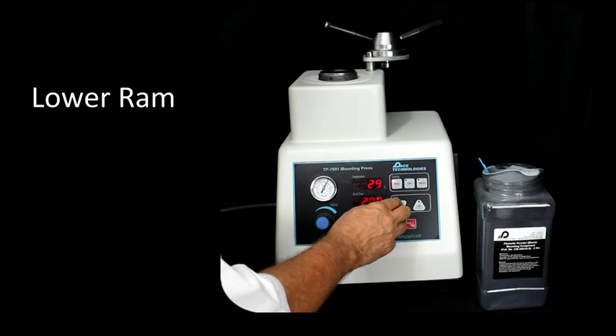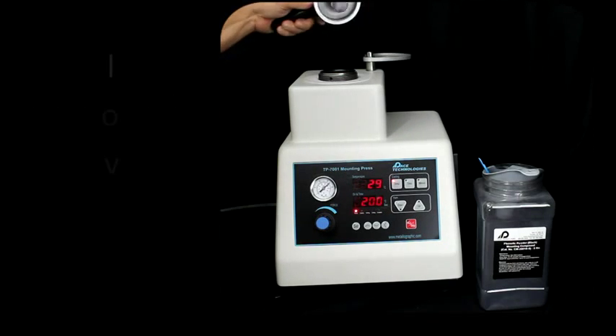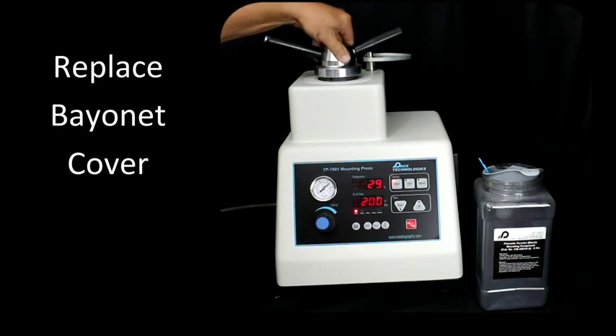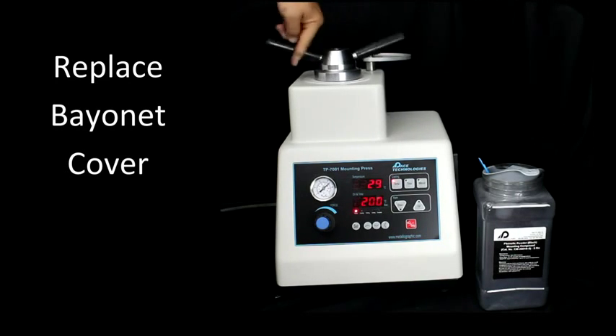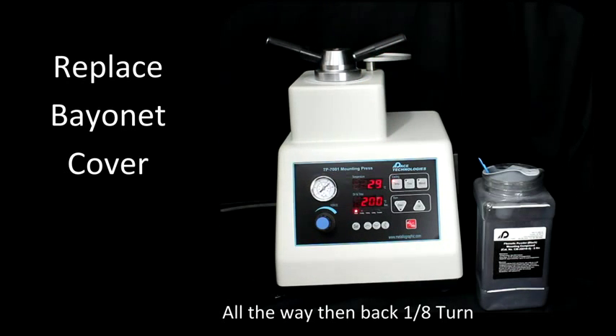Reduce the ram and clean the residual off there a little bit. Screw on the bayonet cover. I like to screw it all the way down and then back it off about an eighth of a turn.